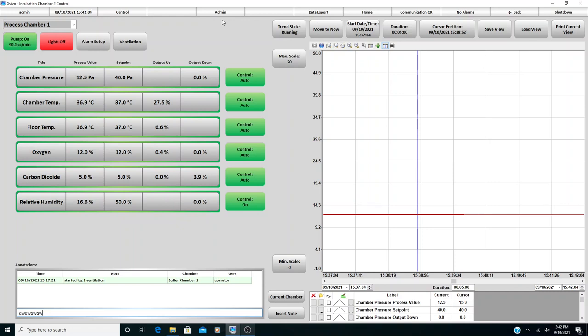We will go over this also in the live session, and again, refer to your manual for more about this. But some cool things you can do in here are create user accounts for people, or go through the event log and see what changes are being made in the Xvivo. It records things as little as turning a light on and off and tells you the username of the person who did that. So that's very useful.